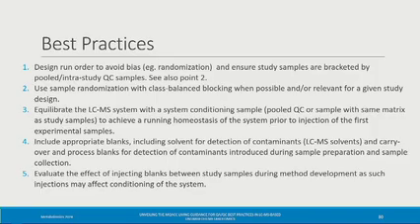I think that might be where it says "where possible" as well, right? Because I think when all this was assembled, it isn't always possible, right? It's just like with the pooled QC. If you've got a study where your samples are coming in over a period of months or years, you can't have the samples at the end pooled with the samples at the beginning if you're going to start running samples before the study finishes, right?